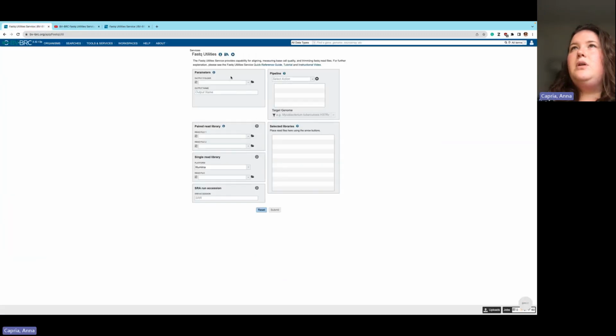So going back to the page, the parameters are going to be where you want this job to end up. Each workspace comes loaded with a genome group, a feature group, and an experiment group. I'm going to put this job in our experiment group, named Zika FASTQ today's webinar, but you can name it whatever you like. I highly recommend being as organized as you can, but just for show, that's what we'll do now.